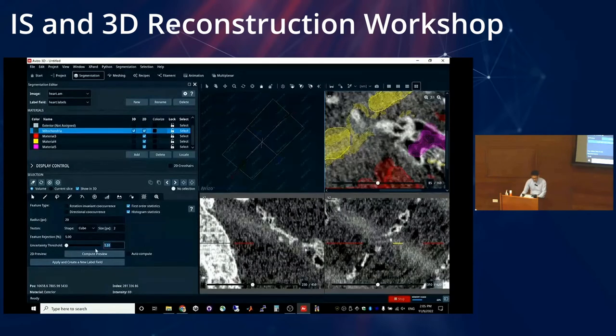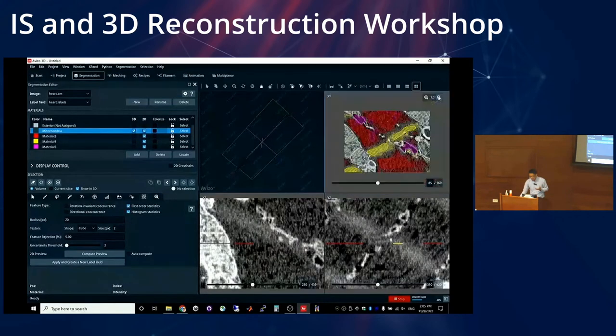And in many cases, that's a good thing. Because it's not sure, leave it be, and then we can use Watershed to fill in the gaps. So I will do just that now, because this is something that I really like. I've used it with some complex data, and I get really, really good results. So I'll do that now. I'm running the texture classification again with a lower uncertainty threshold, so it's more strict. And you'll see the result.